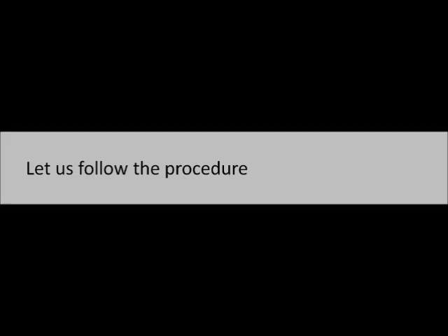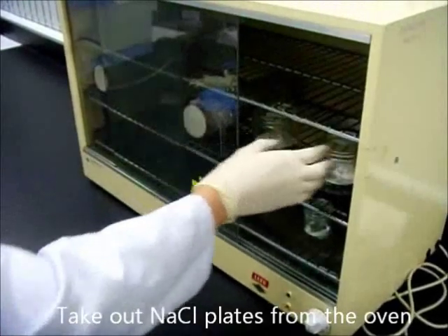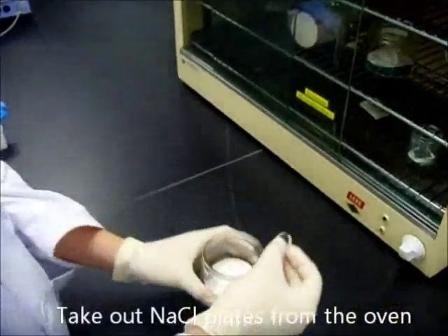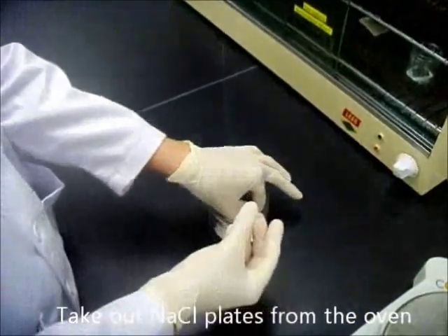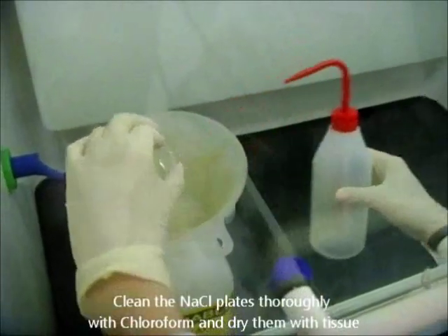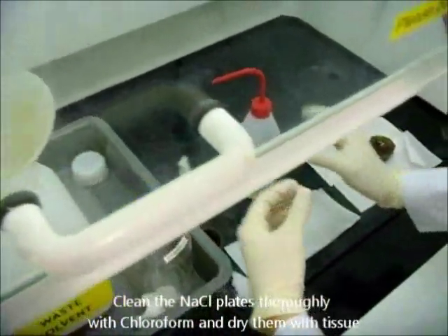Now take out the sodium chloride plates from the oven. If you find that they have become white or non-transparent, it shows that they have absorbed a lot of moisture and that will affect your results — you have to get a new one. Clean the sodium chloride plates thoroughly with chloroform and dry them with tissue.